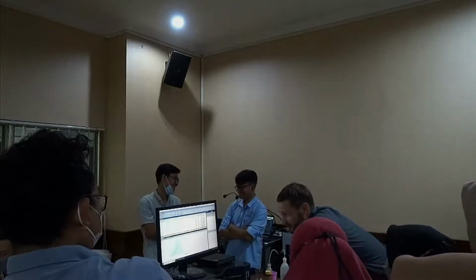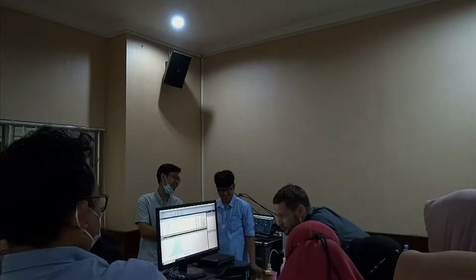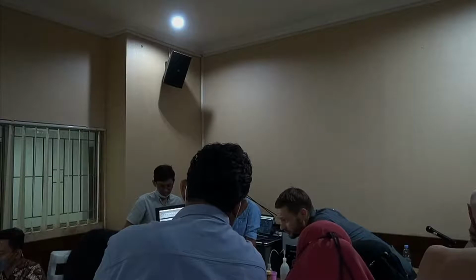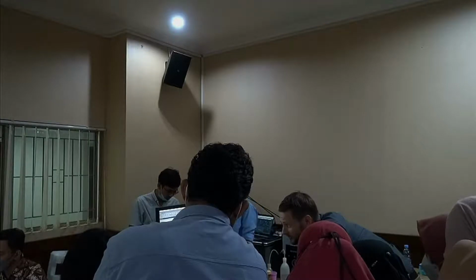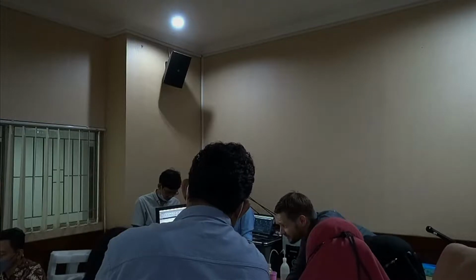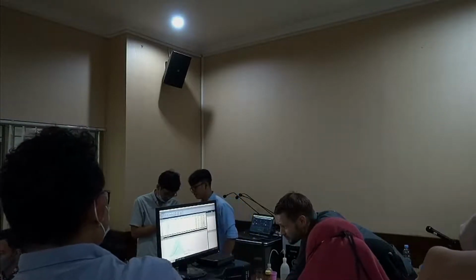Actually, not as bad as expected, but you see a real-life sample, so we don't get the super-duper reproducibility which we had in the beginning. What I first look at is we obviously have a bimodal distribution. So the main peak here is around 2.5, 3 micrometers, but we also have a smaller one here around 20 micrometers, which is not stable. So really the difference between the 3 curves obviously comes from this 20 micrometer peak, which seems to shift.